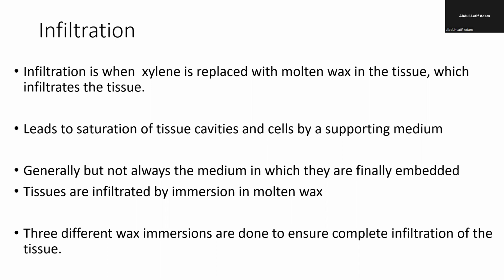When the bread is allowed to rise so much and there are air spaces in it, when you put the knife on it, it just drops, it doesn't cut the whole surface, and it doesn't look nice. So that is the purpose of processing the tissue.